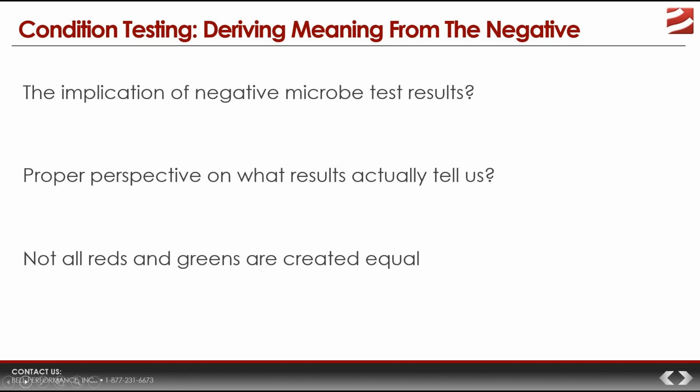And then that number is compared to recommended ranges. And the recommended ranges say if it's below 10, you're green. That means it's not a problem. It's a manageable level. If it's between 10 and 100, you're yellow. That means it's starting to get towards the danger zone, but you're not in a severe contamination point yet. And then if it's over 100, then you're red. You've got enough microbes in there that you've got a severe contamination. You need to do something about that.